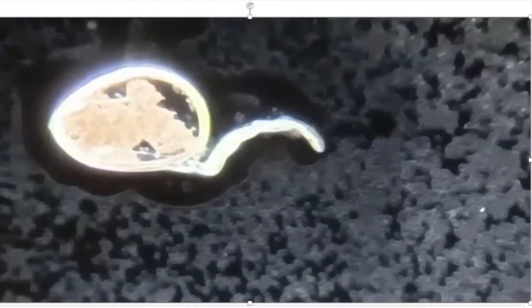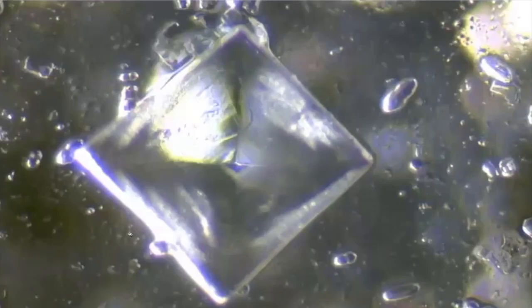Then I just wanted to go on to show also what salt looks like under the microscope, under dark field microscopy. So, this is a salt crystal. It is square. Some people may look at this and say, oh, this is nanotech. It's actually a salt crystal. And when we're looking at MasterPeace under the microscope, for example, which is full of marine sea plasma, we may see some of these. Again, somebody could make an assumption that this is nanotech, a microchip of some sort, but it's actually just a salt crystal.